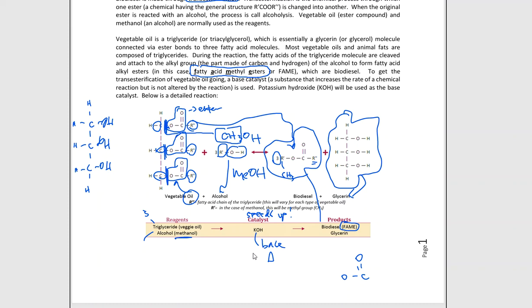The methyl group is often regarded for a 1 carbon. So CH3 group, that is a methyl group. It's a 1 carbon containing compound. So that is the M for FAME. That's methyl coming from our methanol that we are using in the reaction here.